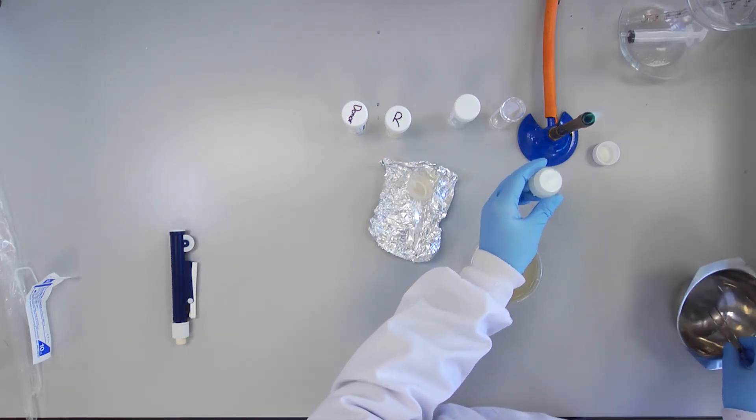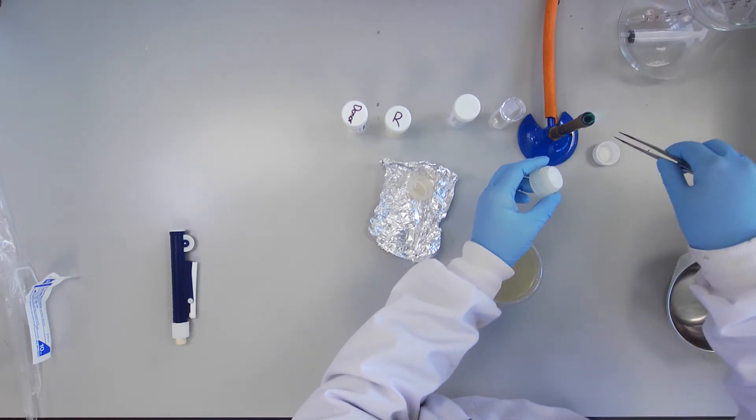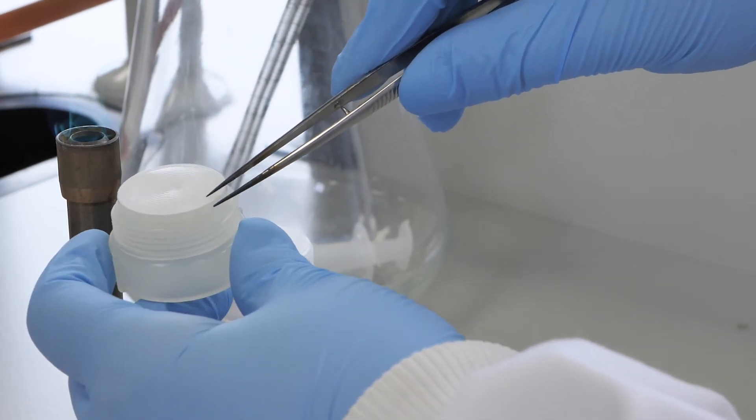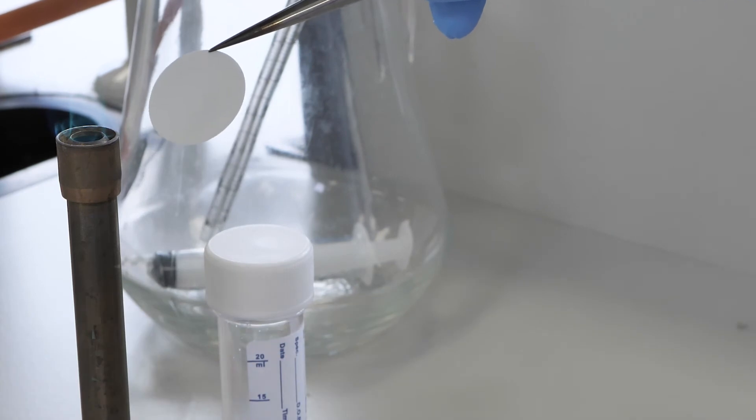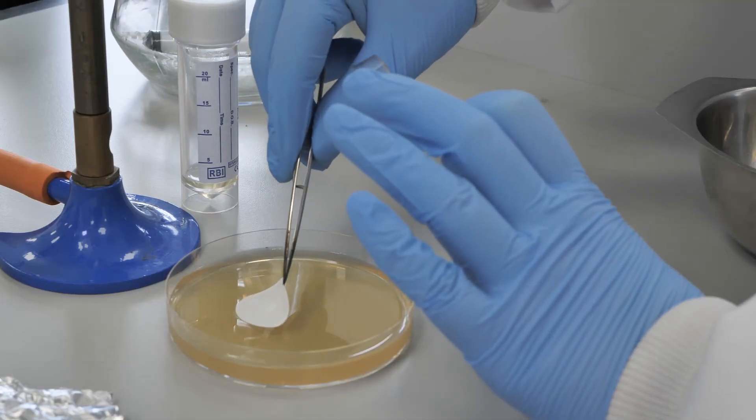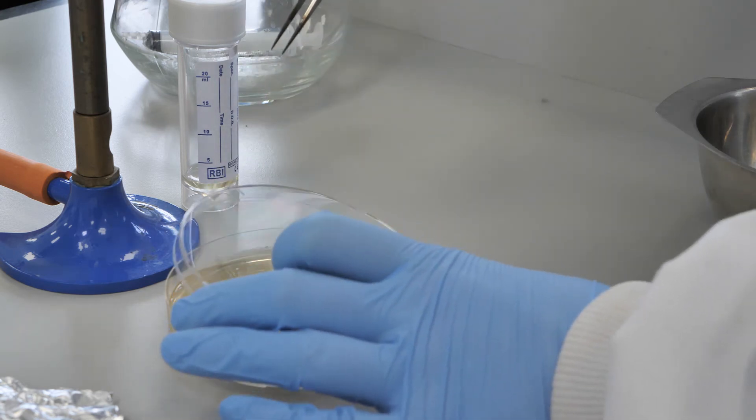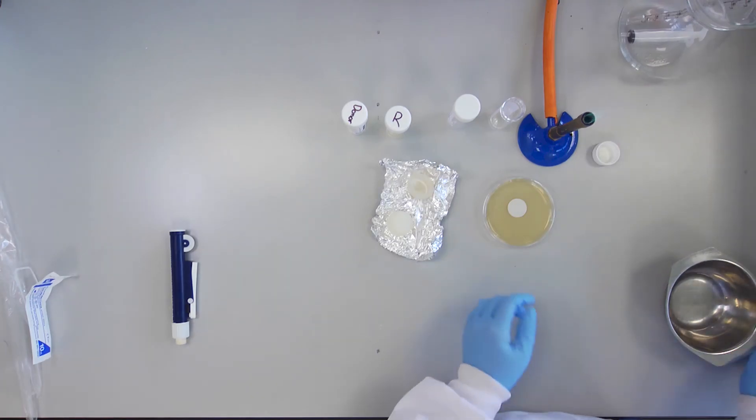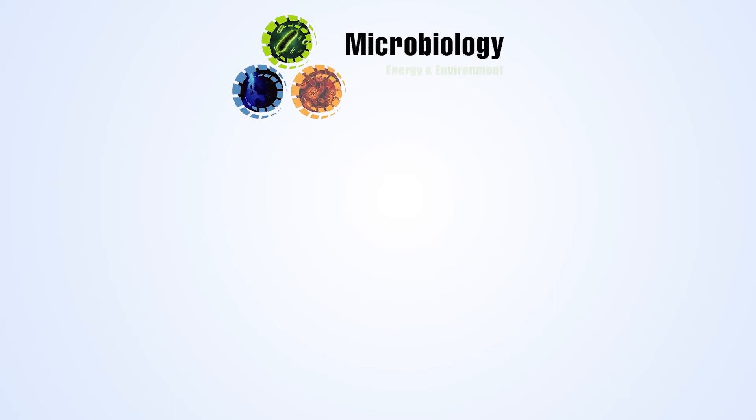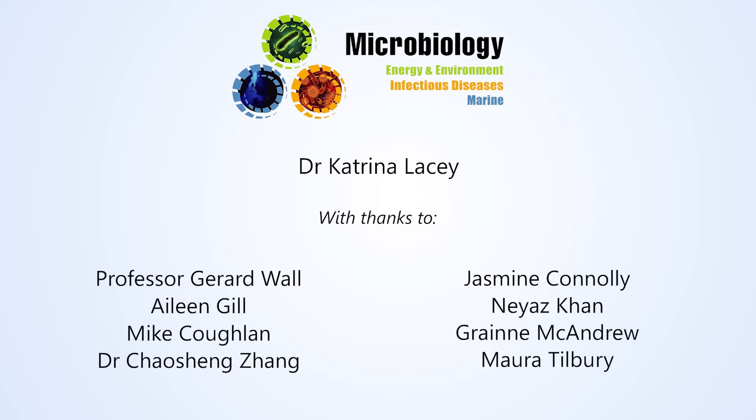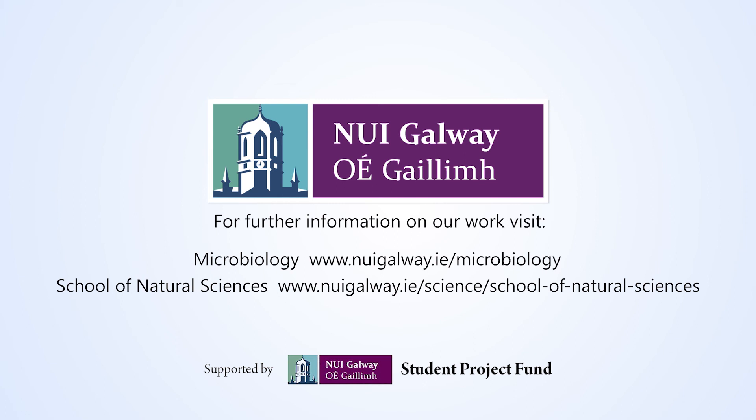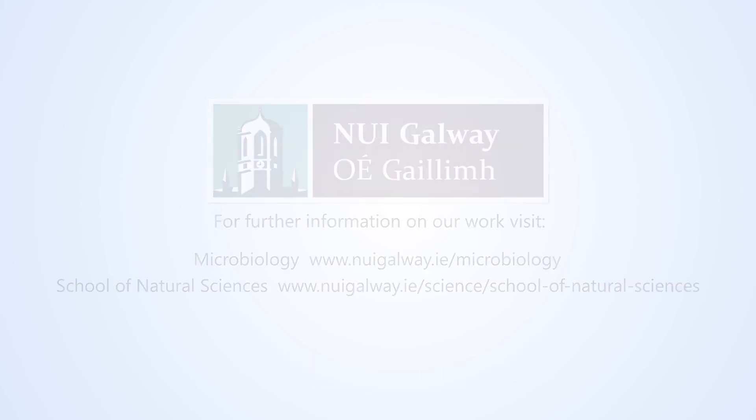Using alcohol, flame the tweezers and transfer the white filter membrane to the surface of the TSA plate. This plate will now be incubated at 37 degrees Celsius for 24 hours.